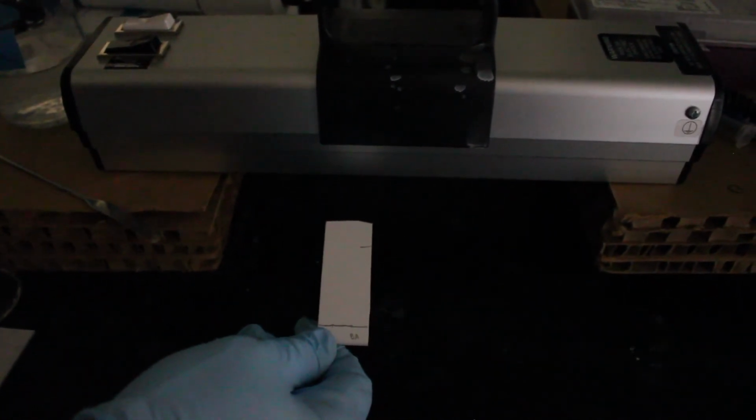There we go. And it's also very important to not look directly into the UV light. This is kind of easy because this lamp is fairly immobile, but some UV lamps are portable and you don't want to shoot it into your eye because the UV light is actually mutagenic, so what we can do is we can turn on the UV light. So as you can see, there's some stationary phase that's fluorescing here from just using this TLC station over.